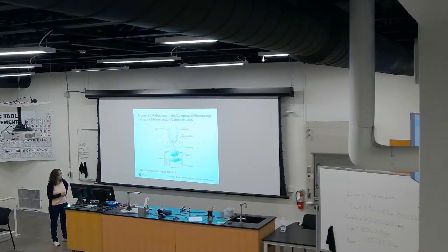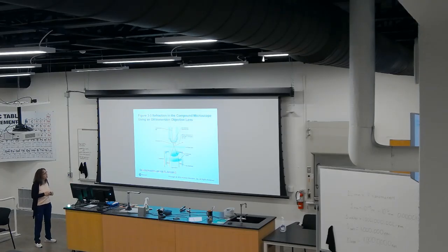And then these rays, of course, will not go perfectly straight. They tend to go a little bit to the sides, to refract. If you don't have anything between the objective lens and the glass slide, you will lose a lot of rays of light that go to the sides into the air.